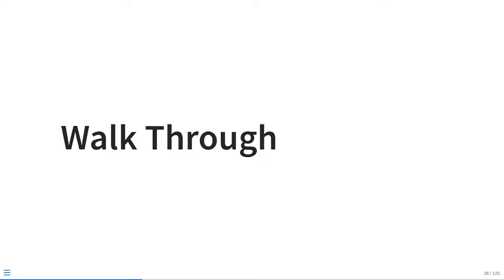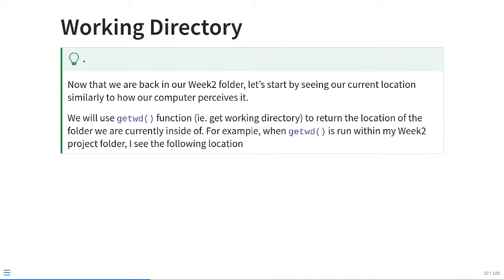All right. And with that, let's start talking about how do we communicate to our computer where to find things and how to locate where you're at currently. So within R, we have what's known as a working directory. So the way you get at this location, and how your computer perceives where you're at in the active moment. So we're going to be showing quite a few functions today. I will be introducing them, and just to remind you, functions are particular tools that do a particular task.